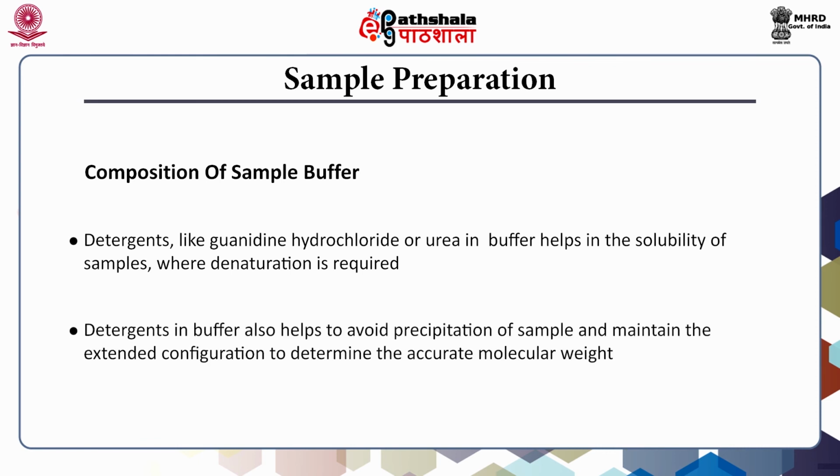Detergents in the buffer will also help to avoid precipitation of samples and to maintain the extended configuration to determine the accurate molecular weight in gel filtration chromatography. So, sometimes we can use low concentrations of detergents in gel filtration chromatography.